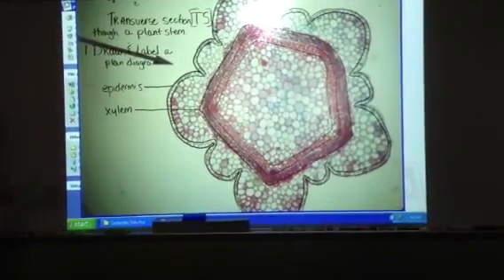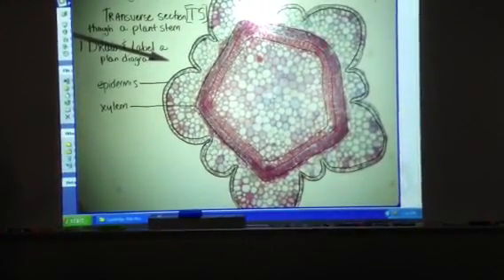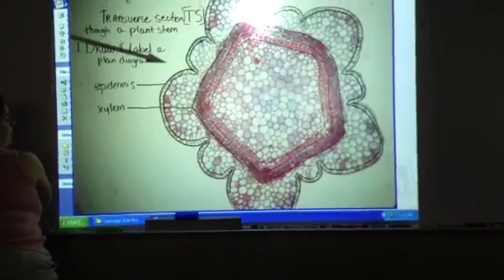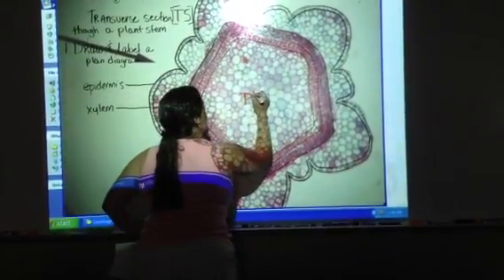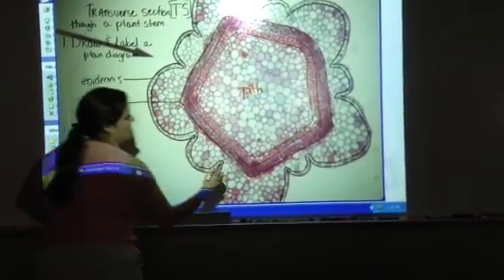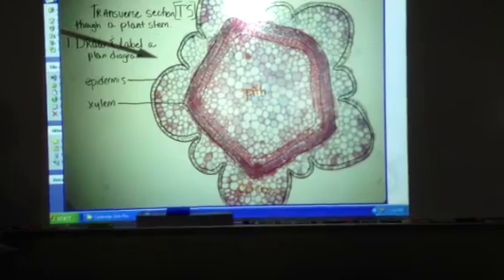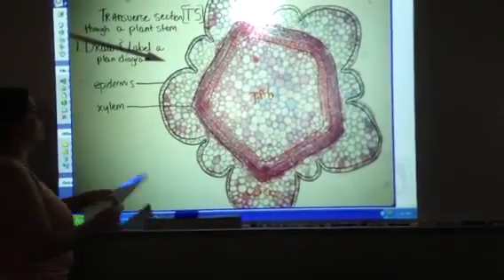However, there are additional questions where you're supposed to calculate the total diameter of the stem to the diameter of the central pith. In order for you to accomplish this task, you would have to actually know what is the pith. So this in the center is the pith. Okay? In case you're not familiar, this outside is the cortex. You would not, under any circumstances, want to write those labels in there on your plan diagram. We're merely doing this for your own educational edification.